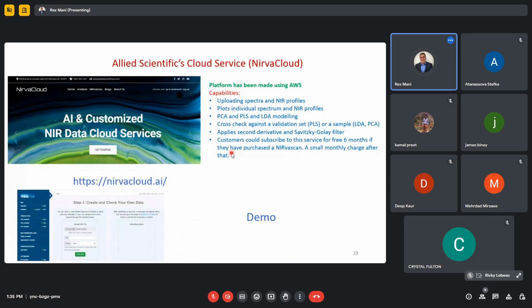So now I'm going to talk about the cloud. This was one primary reason for the webinar, to introduce our cloud and the operation of the cloud, because it's quite important to use the cloud when you're using Nirvascan. And I'll explain why.